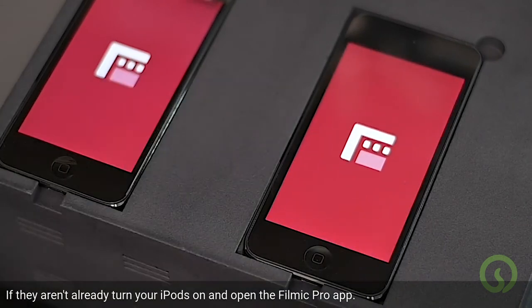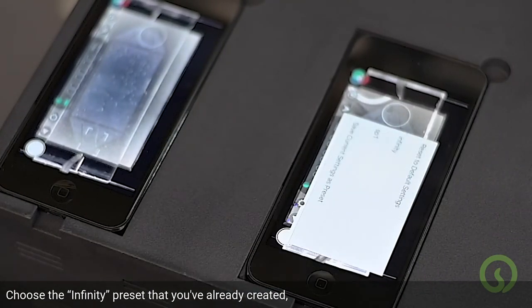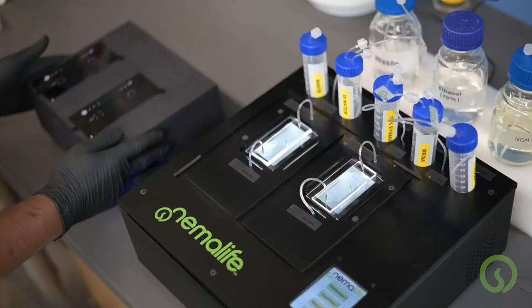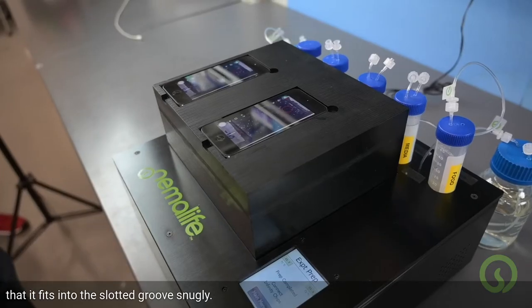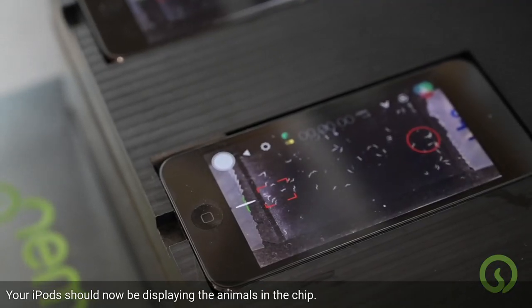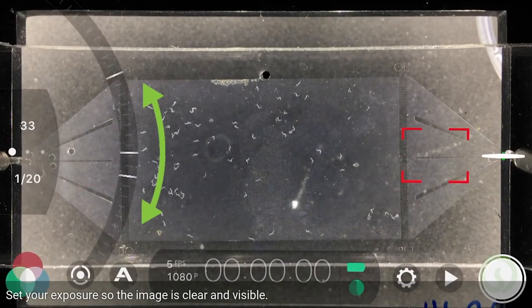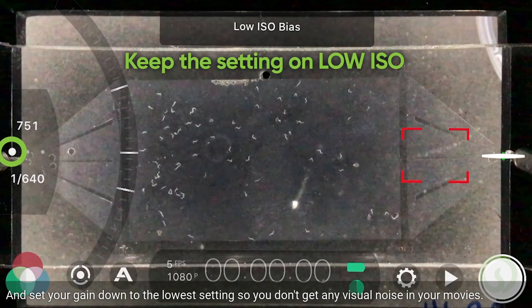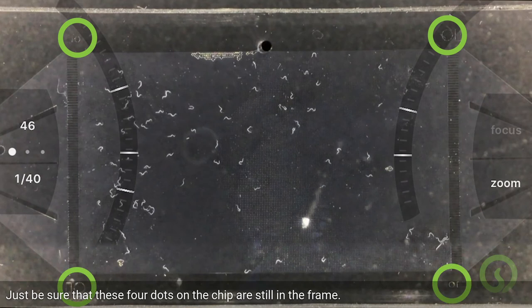If they aren't already, turn your iPods on and open the FiLMiC Pro app. Choose the Infinity preset that you've already created and place the imaging station on the main unit, making sure it fits into the slotted grooves snugly. Your iPods should now be displaying the animals in the chip. Set your exposure so the image is clear and visible, and set your gain down to the lowest setting to avoid visual noise in your movies. You can also zoom in just a bit, but be sure that the four dots on the chip are still in the frame.